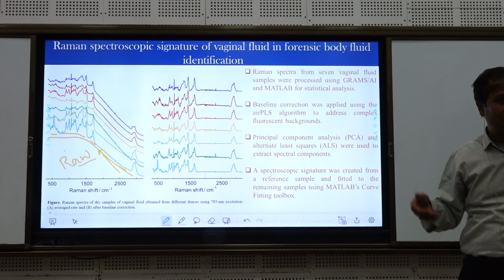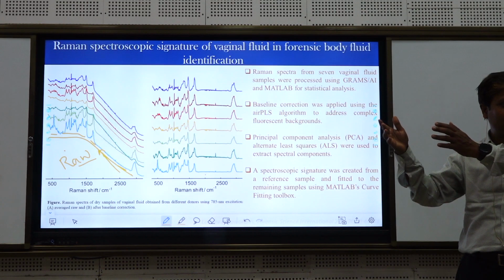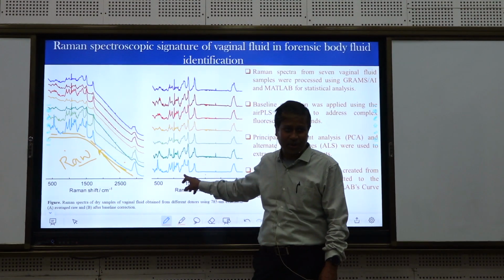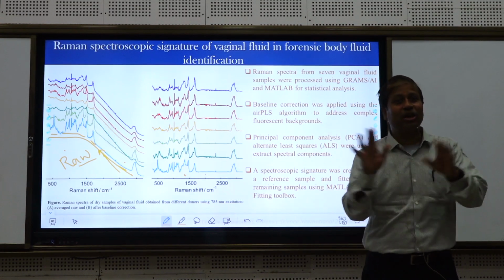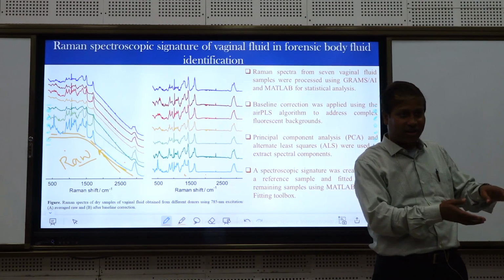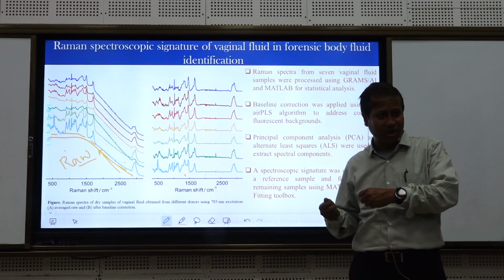So where does this program come from? The instrument manufacturer purchases that software from them, or from an algorithm. This is called an algorithm. They write a program, and if you run that program on this spectrum, then you get a clear, acceptable spectrum. So there are some groups who are doing this. Now imagine if those groups did not do it, then you would not get a good spectrum. But we never think of contributing in that line. One should think of contributing in fundamentals even if it is not prominent.